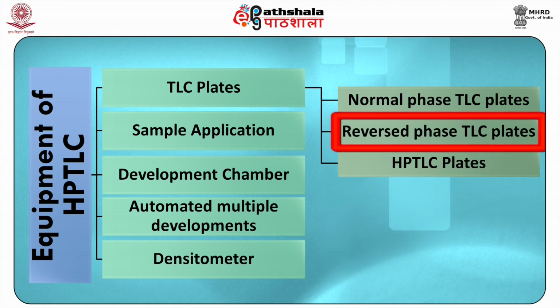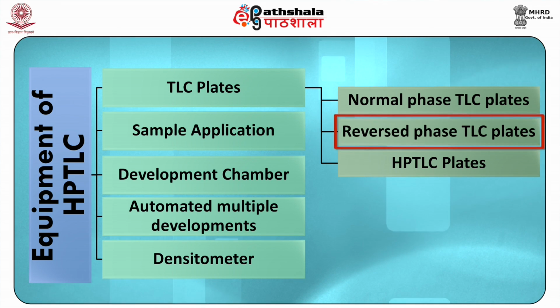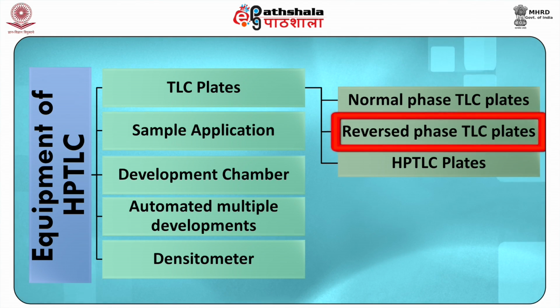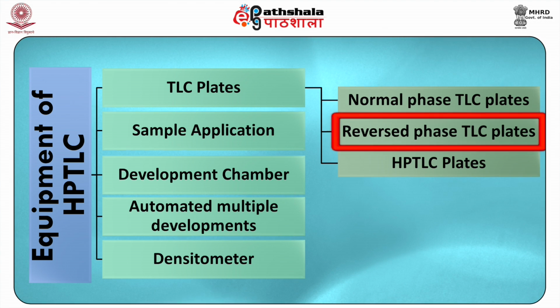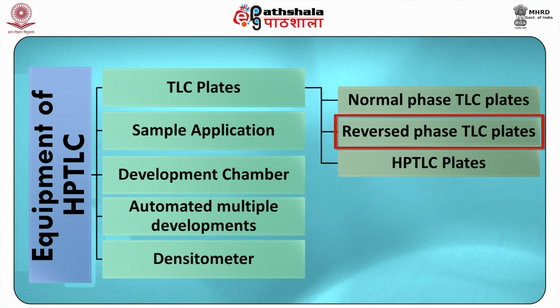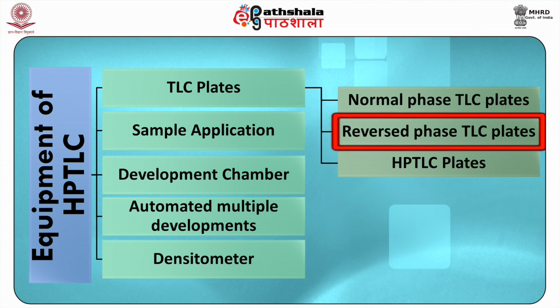Second is reversed phase TLC plates. Because of the interest in reversed phase plates, HPLC pre-coated reverse phase TLC plates are available with C18, C8, C2 and phenyl groups chemically bonded onto a silica support to produce stationary phases.